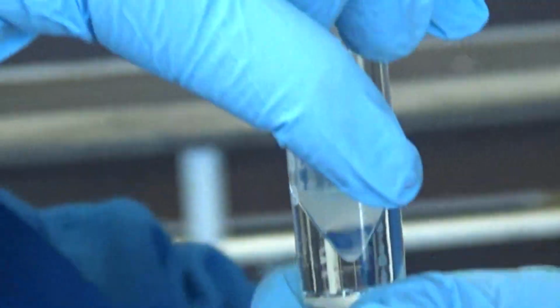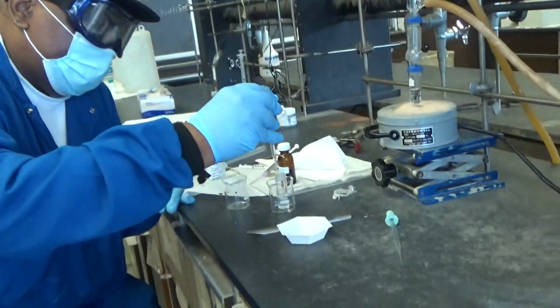See, we have two layers. But with a separatory funnel, you've got a drain at the bottom. With this, you just suck it up with a pipette. You're sucking out the bottom, which is the water. Put that to the bottom like that, and you pull that. That's kind of like draining out the bottom of a separatory funnel. Yes, exactly.